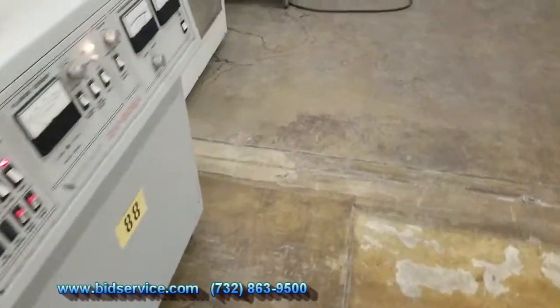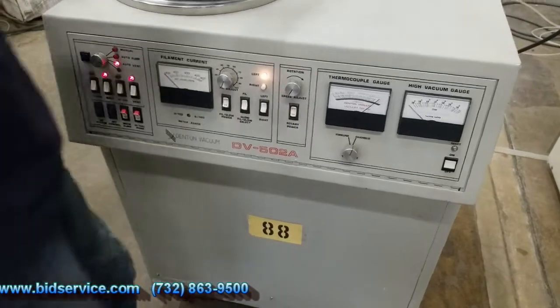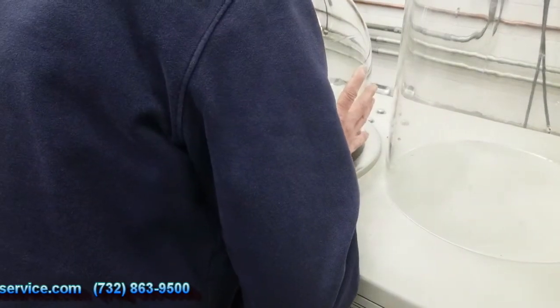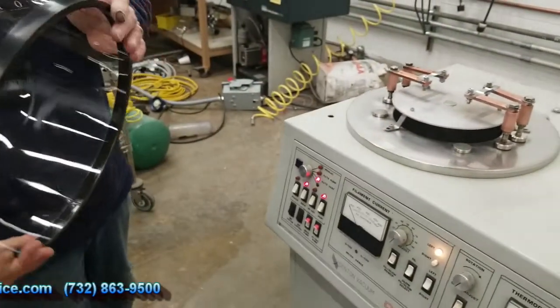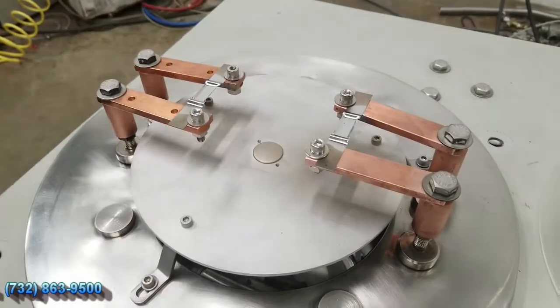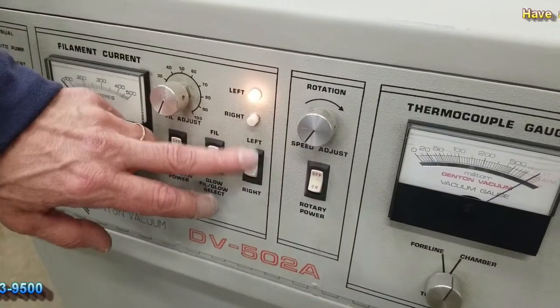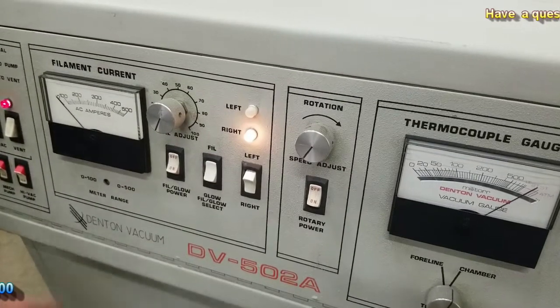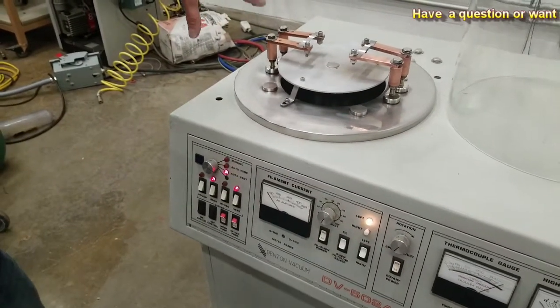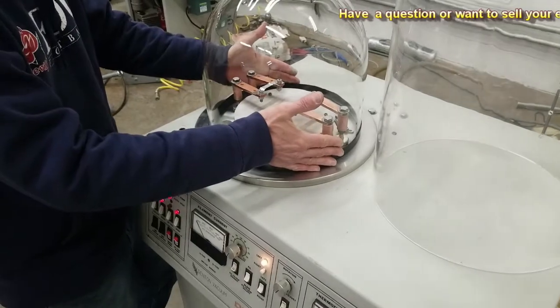Okay, we should be at atmosphere now. We have a protective cover here — I'll take that off. We'll go ahead and take the valve jar off. We've set up two filaments, or boats, on either side of the post here. Each one has an independent transformer and you can switch between left and right. It's currently set to operate on the left side. You load your material onto either boat, then close up the valve jar.